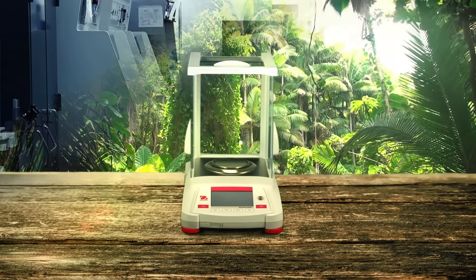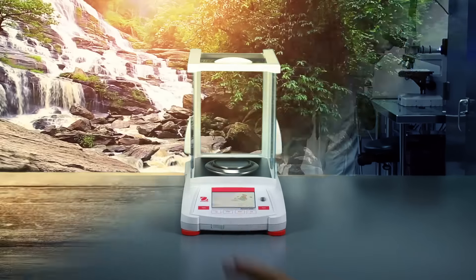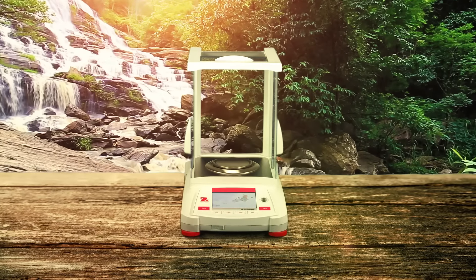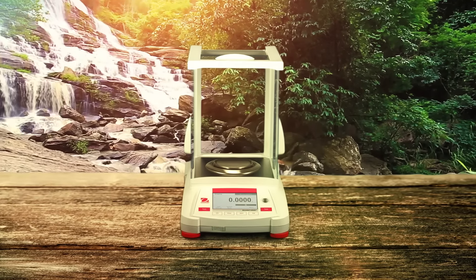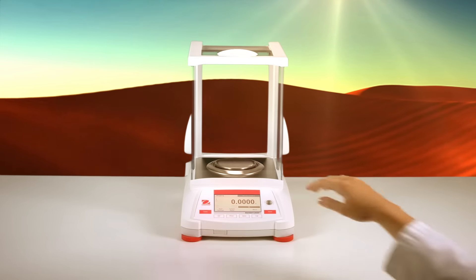It's about the journey and the destination. Your lab. The all-new O-House Adventurer has been carefully designed to meet your needs anywhere in the world. Efficiency, simplicity and innovation all in one exceptional balance.